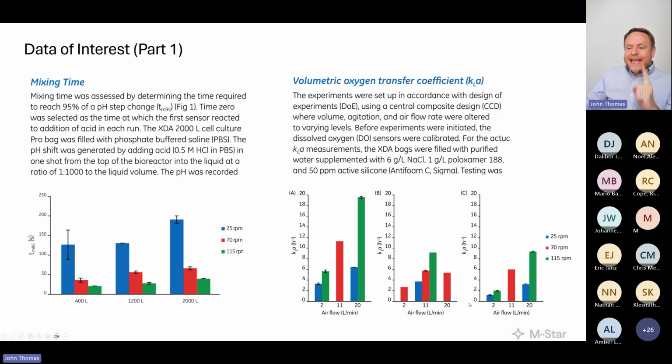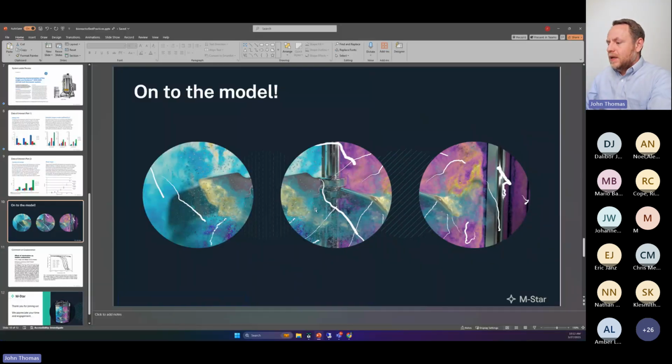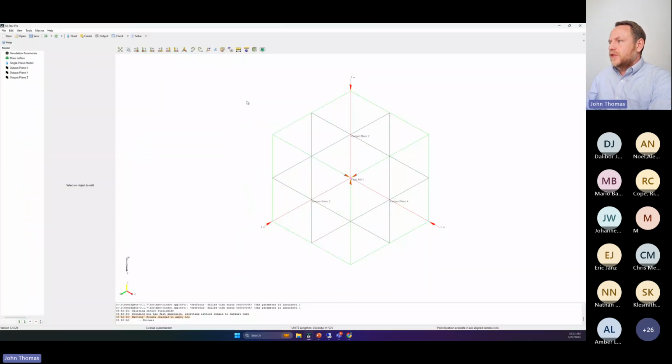If you can have one KLA model, one bubble transport model that captures this order of magnitude variation in KLA, then you know you're doing something right. That's foundationally modeling those physics at the level of the individual transport carriers. Very compelling. Let's get into it, build this model, and start comparing the predictions to exactly what's coming out of the experimental report. For those who know, here's M-Star.